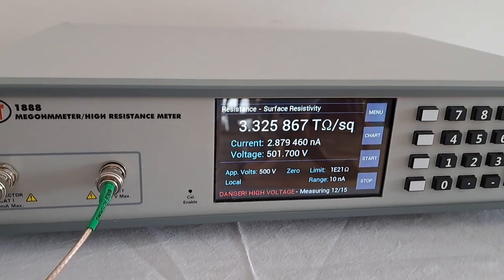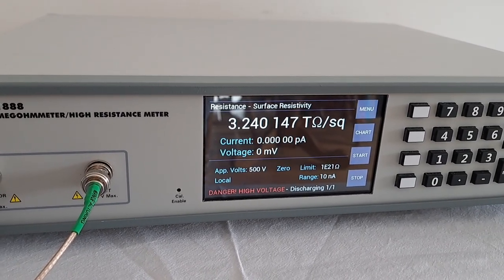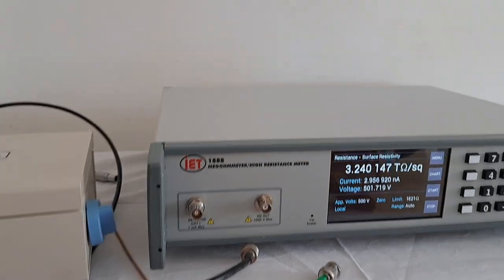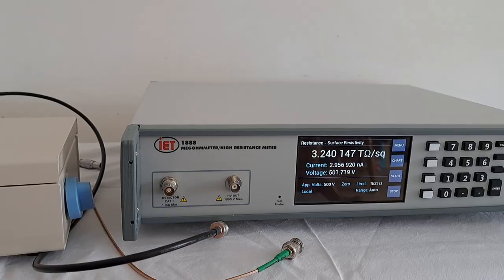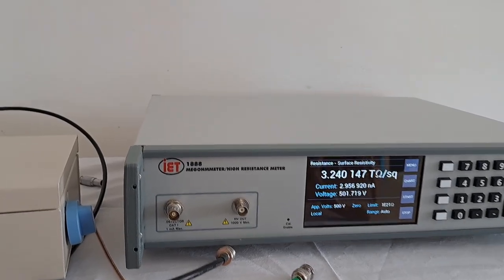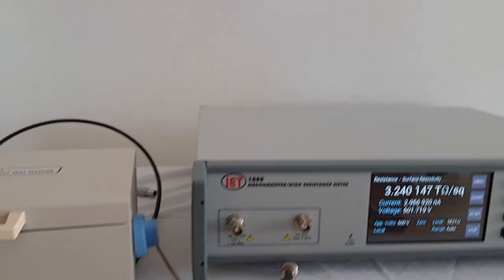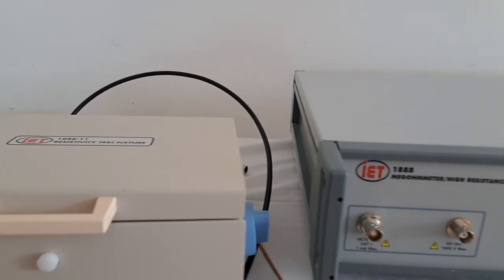That is as easy as it is. The next section of this video will show a little bit more about how it's all connected together as a tutorial. When you receive the 1888, there's an interlock connector which has to go into the back of the 1888. Please make sure that interlock connector is inserted into the back prior to turning the unit on.